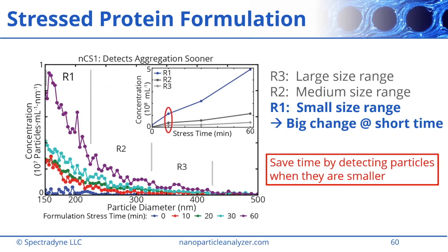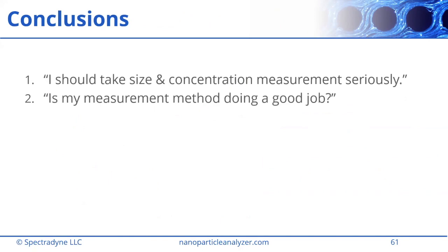Okay, so at this point, I will conclude, I'll summarize what I said and leave you with a few thoughts. So one is, I hope I've convinced you that you should take size and concentration measurements seriously, right? The concentration is the dose, and the size is the efficacy and also the dose, right? Very important.